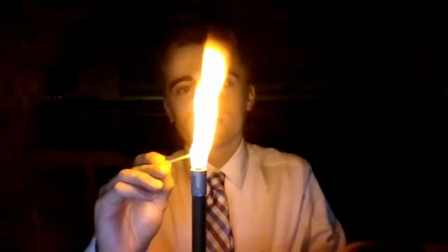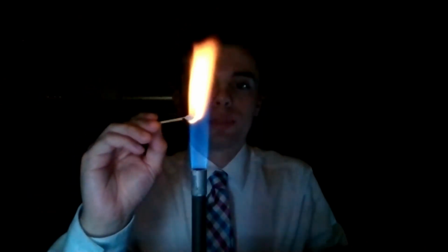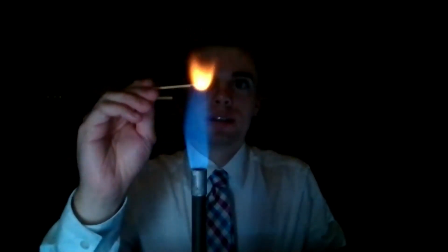Orange. Yeah, it's a nice orange color. If you were here, you can see that the entire flame turns orange. If I stick it in up here, you can see how the bottom of it is still blue, but the top is that orange from the burning sodium.